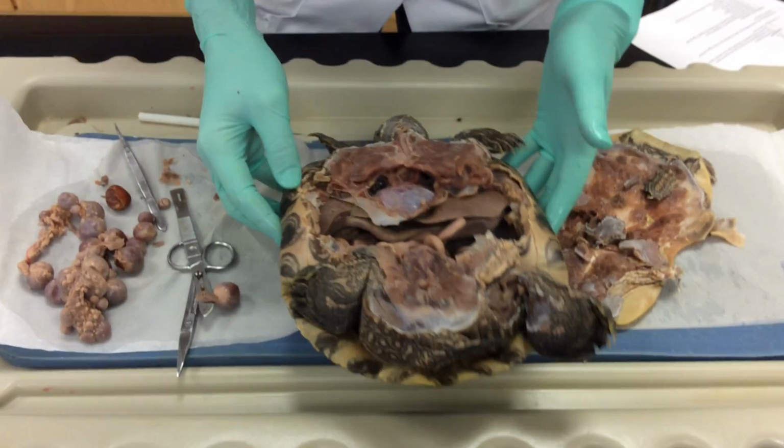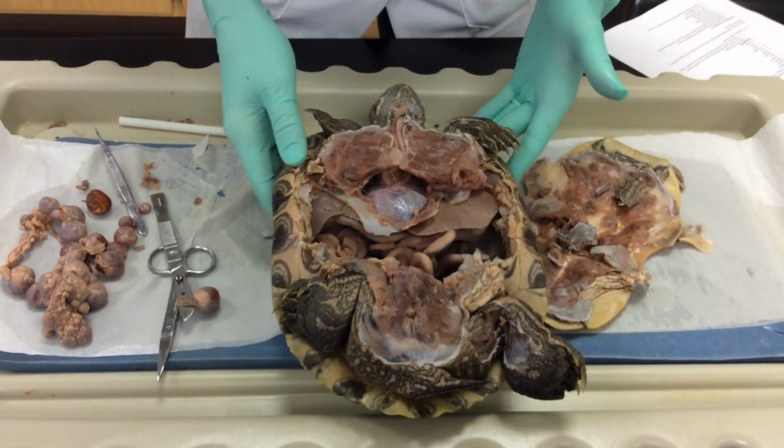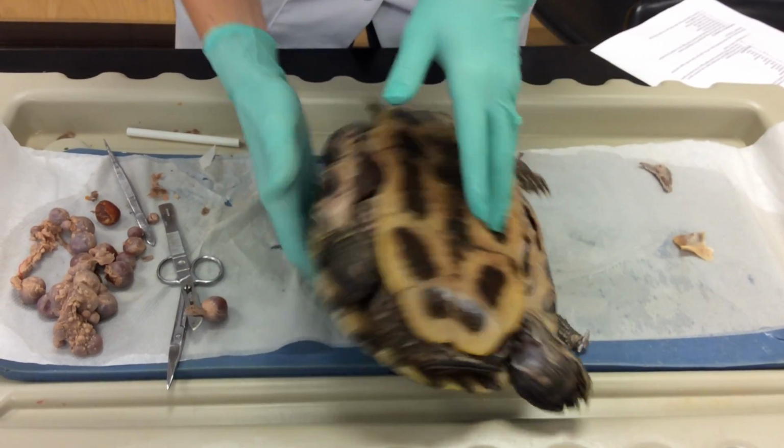Alright, so this is the red-eared slider. We're doing a turtle dissection here, and we're going to look at the different anatomical structures. We're going to start on the external anatomy first, and then we'll go down.